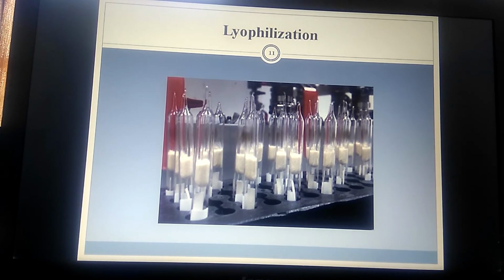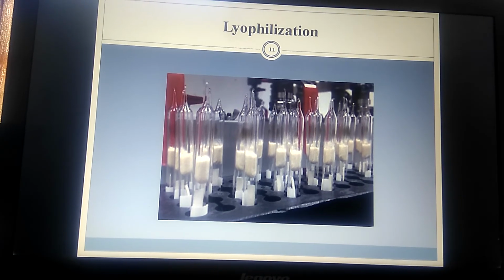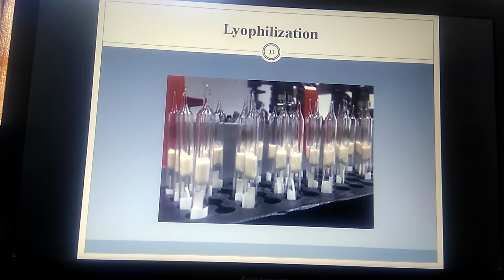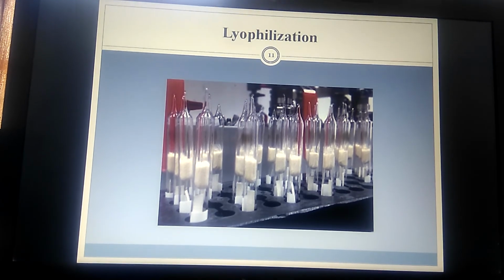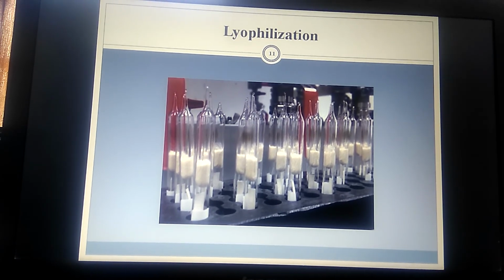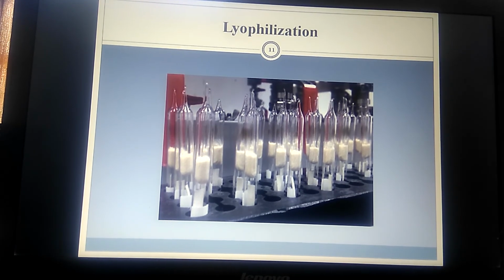Refrigeration and periodic transfer of fresh media will be used in the smaller laboratories for less than 1 year or less than 1 month. The freezing and the cryopreservation will be for 15 years or longer. Lyophilization is for transportation and so on. There are different techniques used for different purposes, so we will use the technique based on what the requirement of the experiment is.